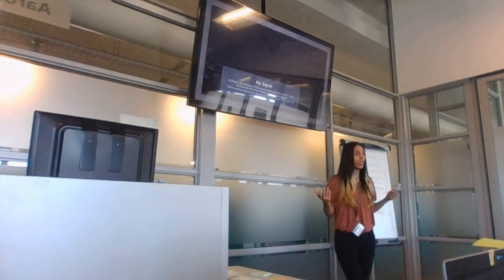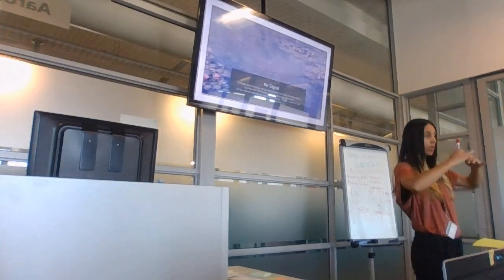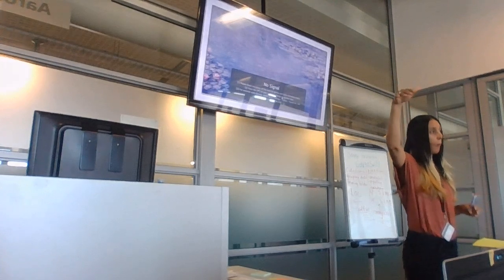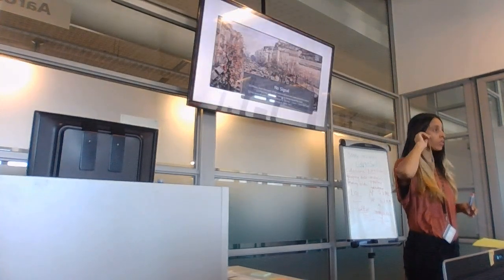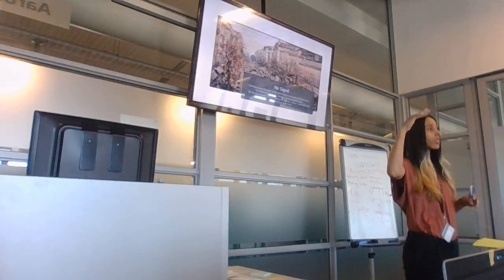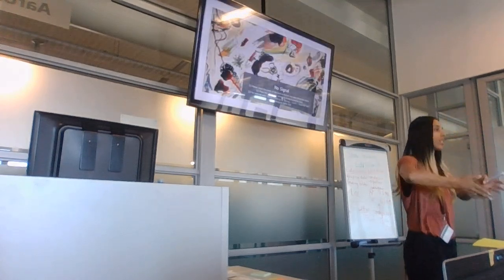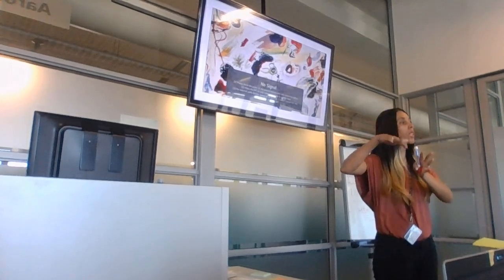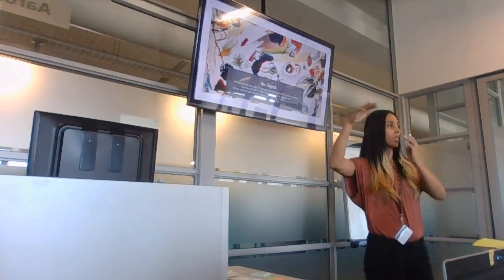It can't. It takes your actual file with all of your reads. Let's say you have 100 reads in there, and it compares them to a database, like BLAST, with reads from other organisms, and it says we took these 100 reads and we consistently saw that they kept matching the 60,000 reads of E. coli.